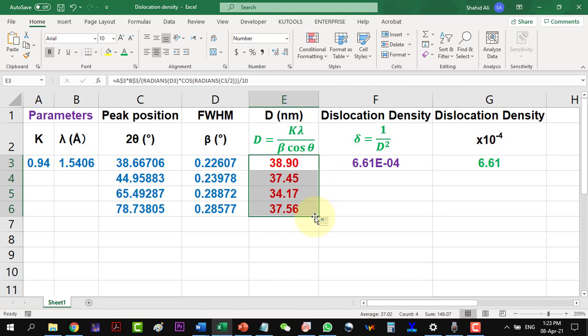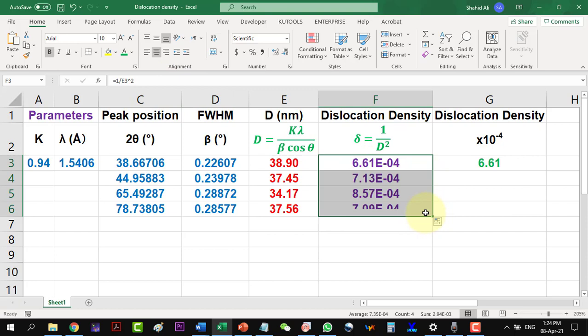Now we can calculate the dislocation density values. And here is the dislocation density. I can drag it for the other values. As exponential minus 4 is with all the values, so I can take this as common, as 10 raised to the power minus 4. So here are the dislocation density values.